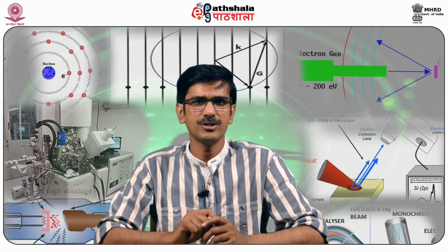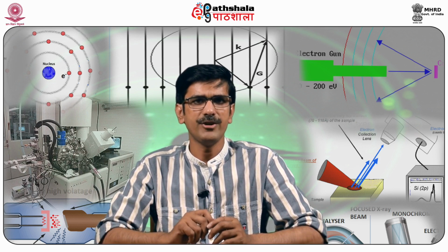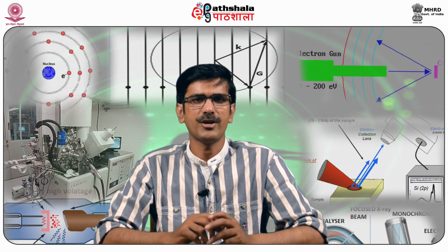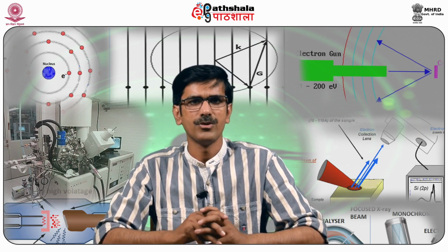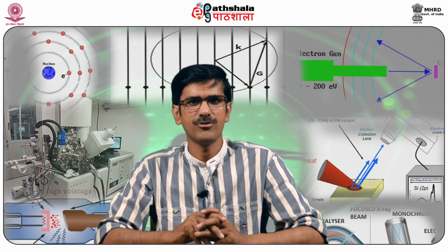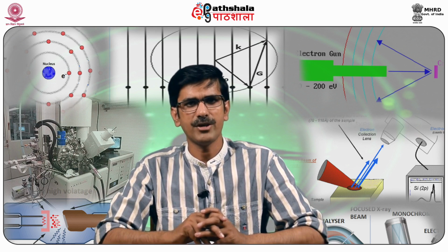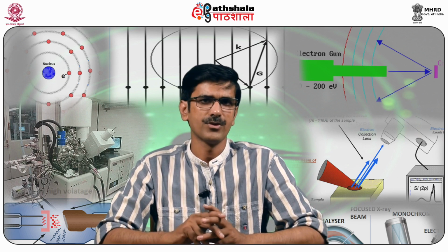The peaks of hydrogen, oxygen and fluorine are not visible, which shows that the instrument has a beryllium window. The small peak of titanium shows that it may be present in a small amount. From the table having values of K alpha 1, K beta 1, L alpha 1, L beta 1, M alpha 1, M beta 1, we can match the energy values and identify the elements present in the sample.